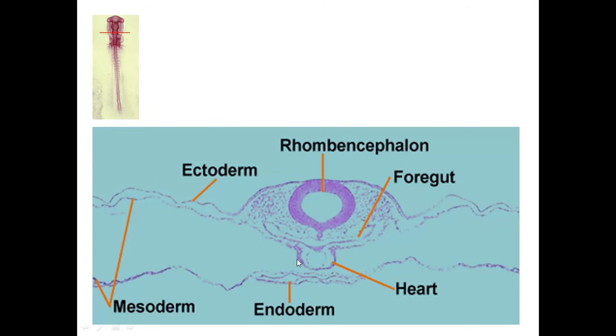This one nicely represents the primordia of the heart. The structure here is the heart, which corresponds to this gut. Right? Foregut is still seen. Then I want you to remember that the cuts that actually run through the heart at the 33-hour stage of the chicken embryo are closely associated with the hindbrain, the rhombencephalon. So whenever you see the heart, then you expect that the brain region associated to it is the rhombencephalon, or the hindbrain, at the 33-hour stage.